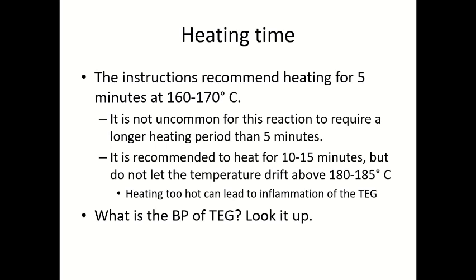The instruction in case of the heating time recommends heating for 5 minutes at the aforementioned temperature range. It is not uncommon for this reaction to require a longer heating period than 5 minutes, but it is recommended to heat for 10 to 15 minutes, but not let the temperature go above around 185 degrees Celsius. That's because heating too much can produce inflammation of the TEG.